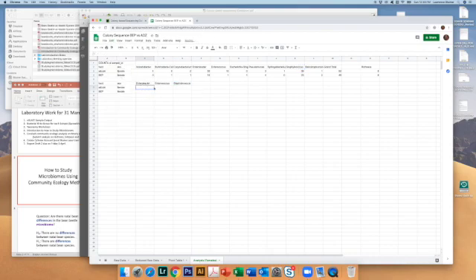Okay, now what I want to do here is calculate the percentage of the total number of samples. That is, the proportion of the total number of counts that are represented by these 3 genera, which appear to be the most common genera overall. Though you can notice for black-eyed peas, it's not very common. Enterococcus is not very common for black-eyed peas, but it certainly is for the bacterial colonies that were isolated from beetles, female beetles that came from Adzuki beans.